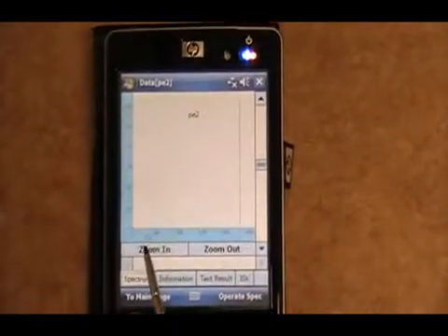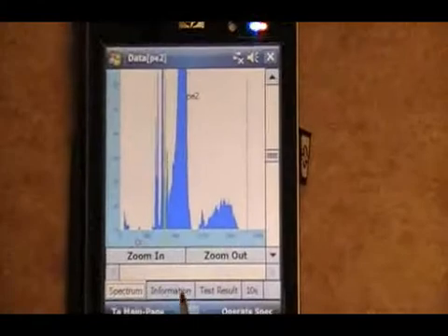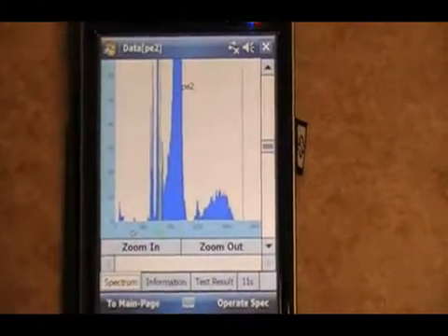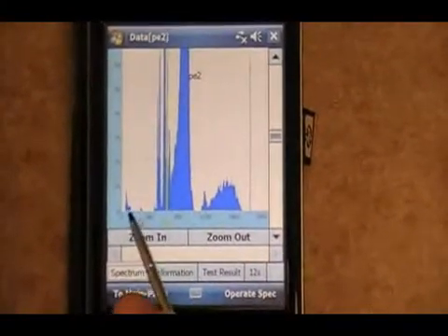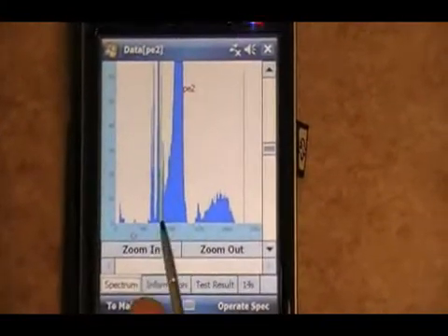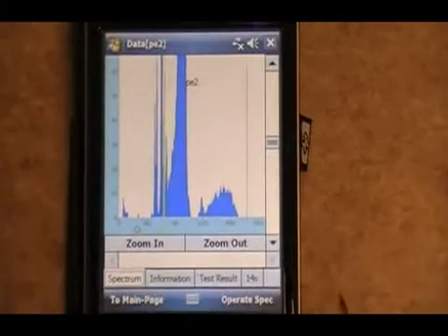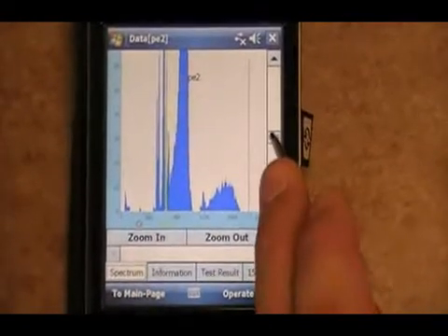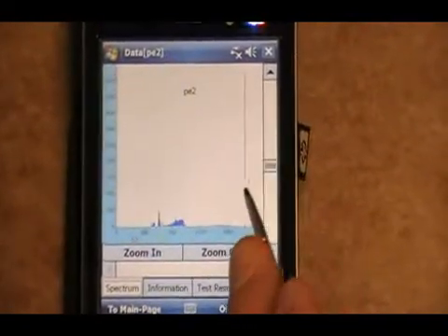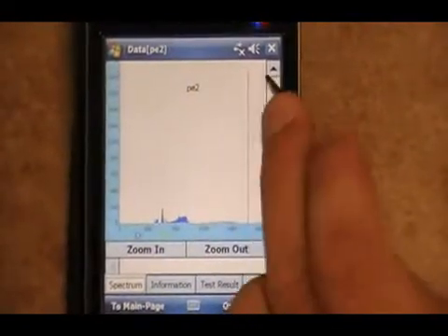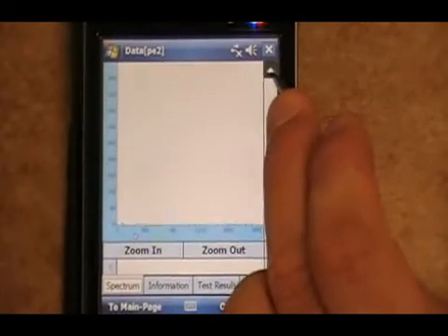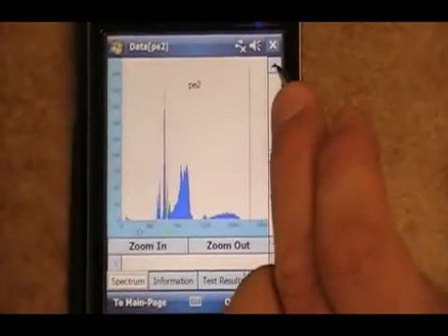Again, here you can see that the chrome is still there as far as showing it, as well as the lead is now the light green peak. We'll reduce the intensity, not quite that much. You can also just tab the arrow.